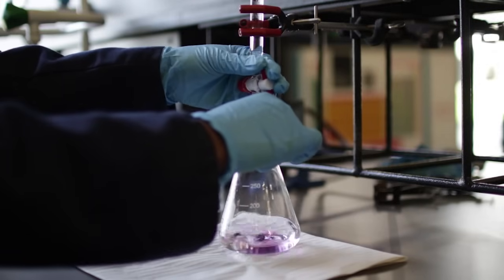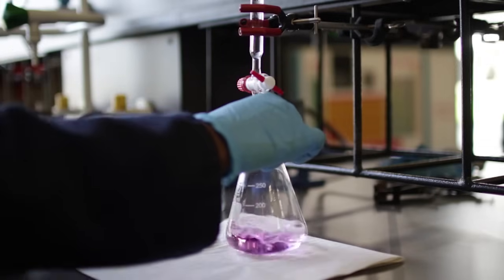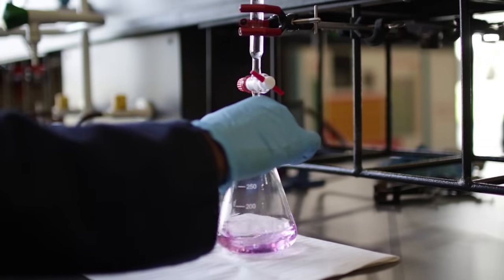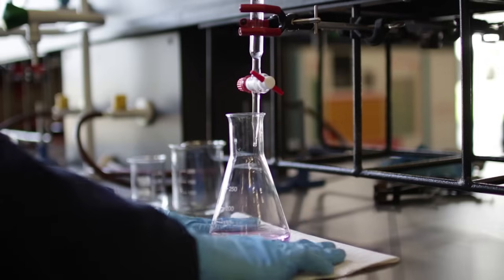Eventually, a color change shows the correct amount that has been added to react completely with the analyte chemical in the sample.